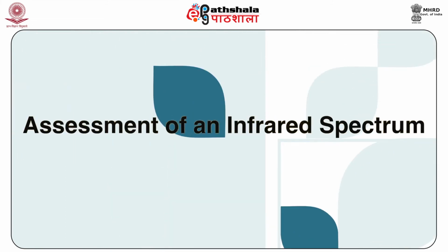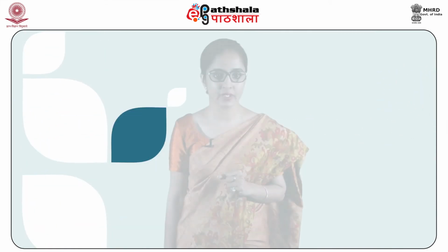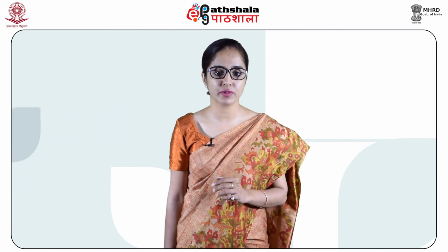Next application, students, is the assessment of an IR spectrum overall. IR spectroscopy is an extremely effective method for determining a variety of functional groups present in a particular molecule. The best way to analyze an IR spectrum is to start looking from the high frequency end of the spectrum, that is typically at 4000 cm⁻¹, and then move towards the lower frequencies. Some of the most common and distinctive absorptions are organized into several regions which I am going to state.